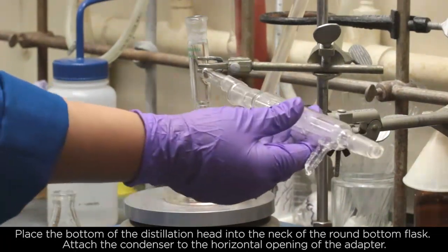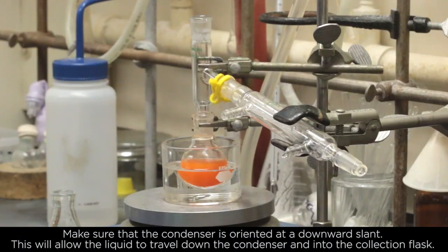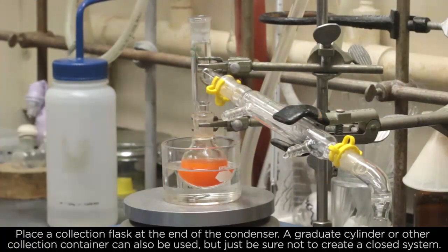Attach the condenser to the horizontal opening of the adapter. Make sure that the condenser is oriented at a downward slope. This will allow the liquid to travel down the condenser and into the collection flask. Place a collection flask at the end of the condenser.